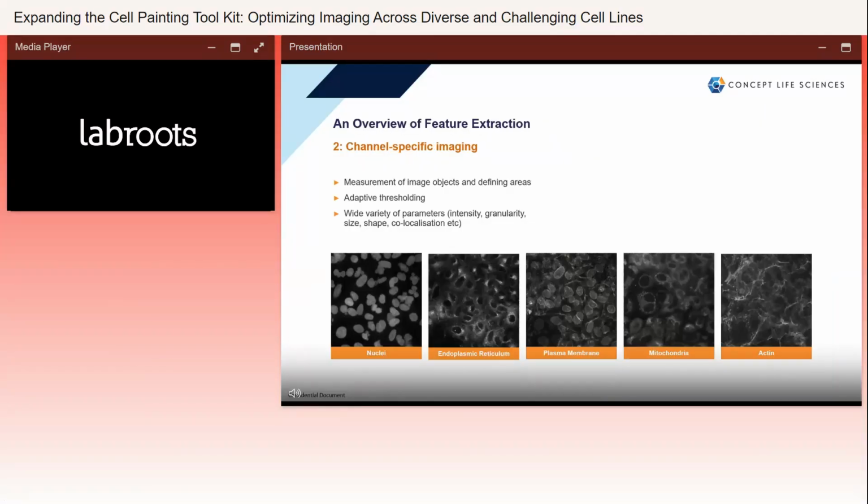Channel level granularity of feature extraction is where the phenotypic differences between treatment groups can become evident. Labeling key organelles allows individual cell-to-cell comparison and gives an indication of the phenotype. Nuclear shape and DNA content informs on cell cycle phase, nuclear fragmentation or multinucleation. Endoplasmic reticulum stress and expansion can manifest as an increased texture.